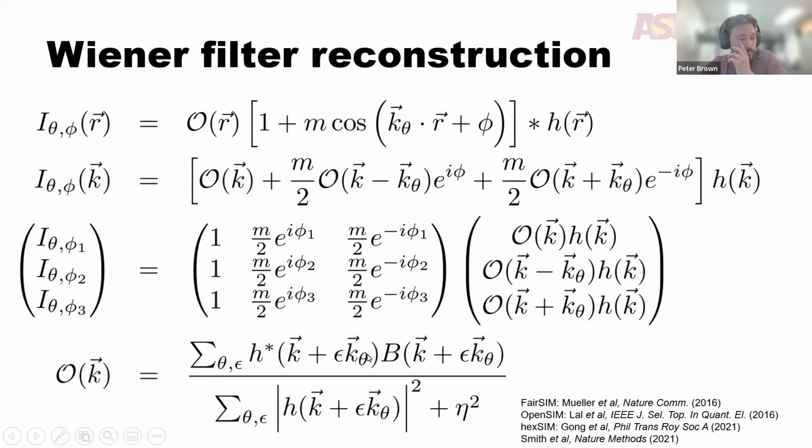So the way that we combine the bands, we take our bands, and then we have to shift them by the proper frequency vector to put the information back in the correct place in frequency space. So for example, this shifted band, we have to add a factor of k_theta to move it back to the right place. And so that's exactly what this term is.